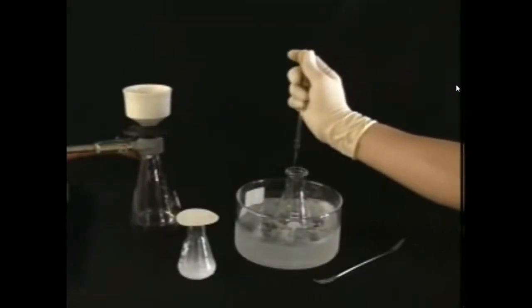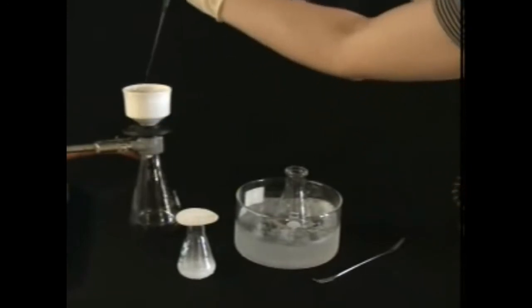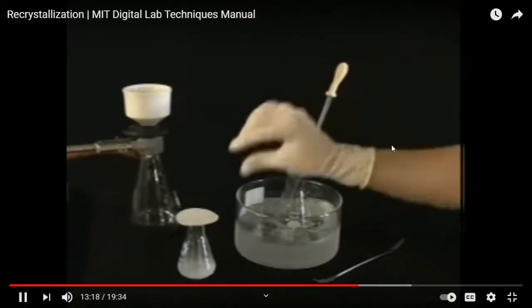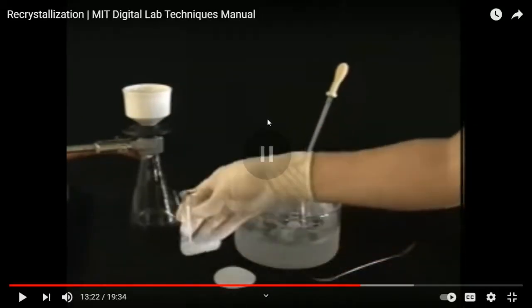Always use a clean, dry flask to collect the filtrate. In many cases, a second batch of crystals can be obtained by concentrating the mother liquor and crystallizing a second time. Turn the vacuum on and wet the filter paper with a small amount of cold solvent.